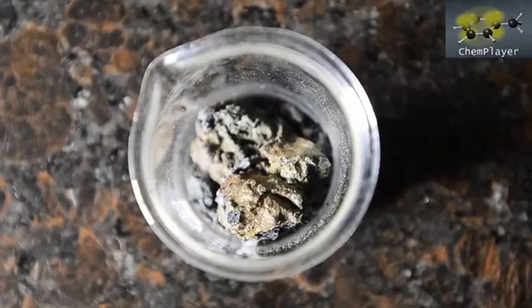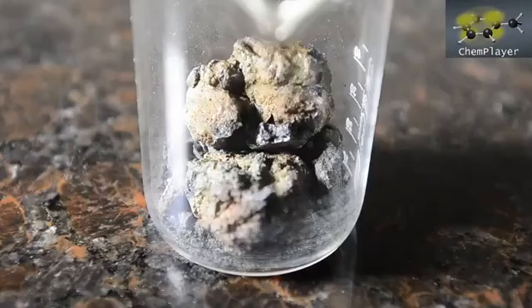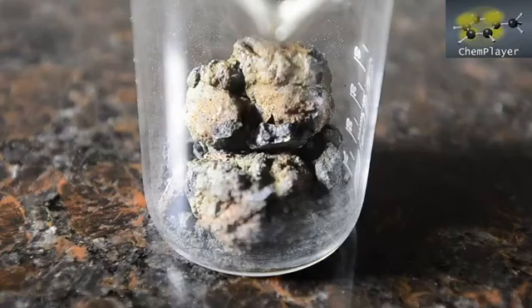But what we want to know, the million-dollar question is, how much active cyanide is still left in here? To find out, we're going to perform a reaction and see if we can convert the alkali cyanide present into a copper cyanide salt, copper 1 cyanide.